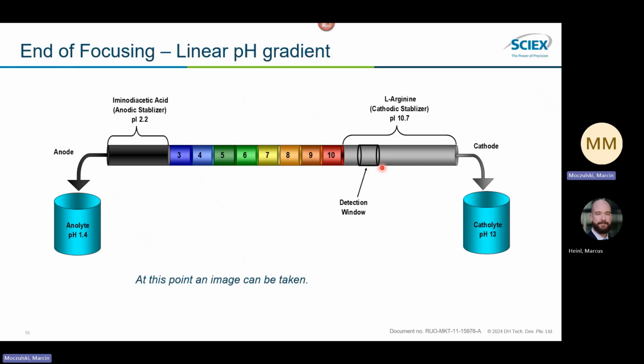Both must be in optimized high concentration, which increases conductivity in these zones, and by this reduces the local electric field for hydronium and hydroxyl ions coming through the capillary, because we still provide the same voltage in the separation process. By reducing movements of hydronium and hydroxyl ions, we can keep this gradient obtained during focusing constant. It's not movable for the moment.